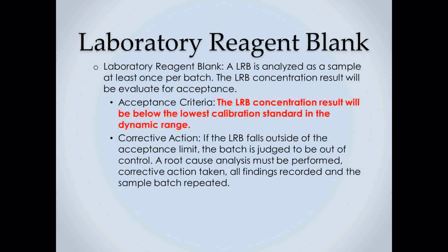For the auditor or inspector that comes in to look at things, they actually know for this method, if you're using this method, you're going to have the following for me to be able to review, including if you have something that's out of control, what is the corrective action taken, what is the root cause analysis completions, where are your findings, and show me that you repeated the batch.